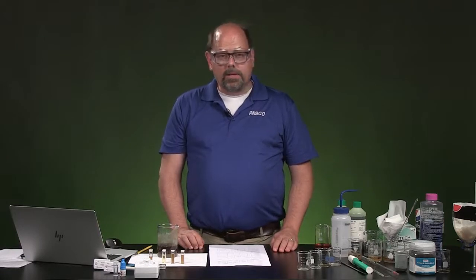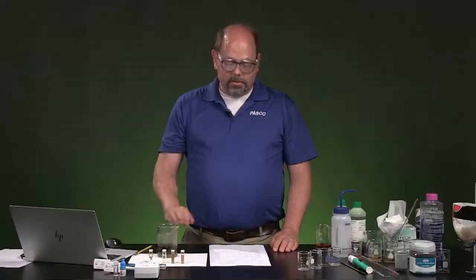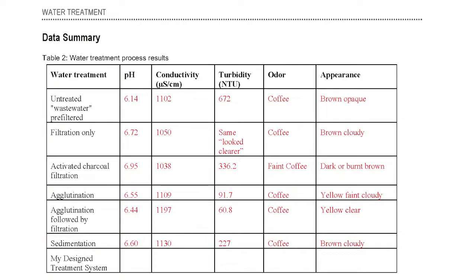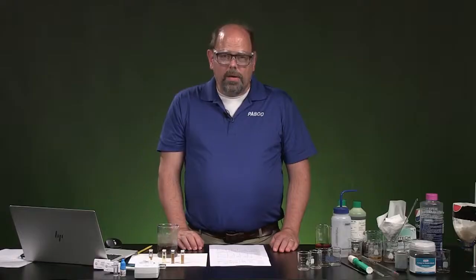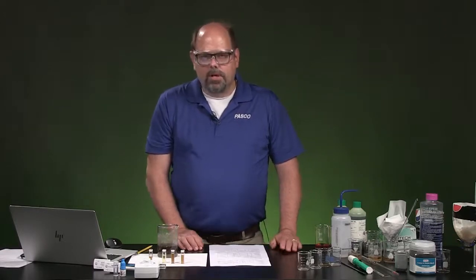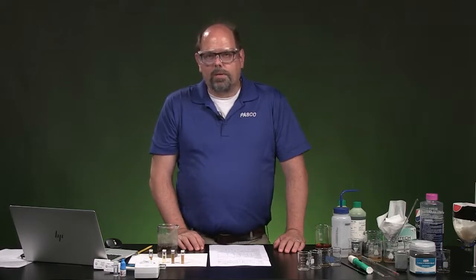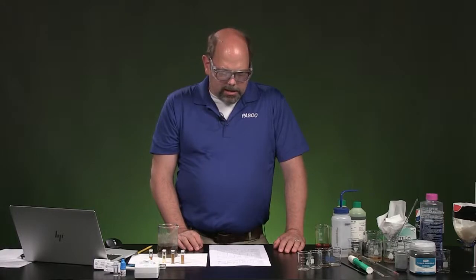Next, let's go to conductivity. Conductivity in this untreated, unfiltered water was about 1100. If you look in the examples that we took, almost all of them had a little higher values of that, so they may have picked up a little of something in those papers, maybe something that's dissolved in the paper itself. Like I said, some papers are usually treated with light acids when they're being processed from pulp into this, and so they may retain a touch of their properties.